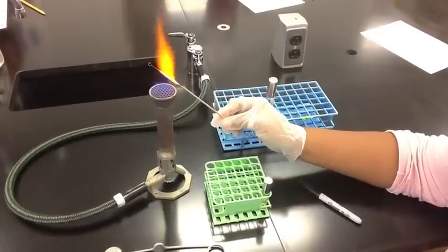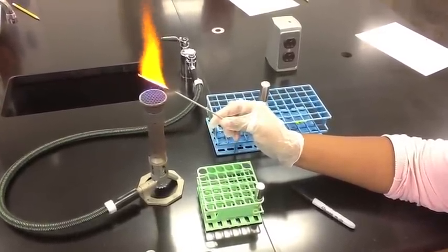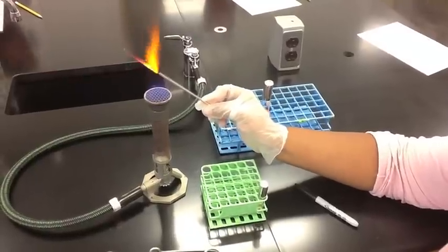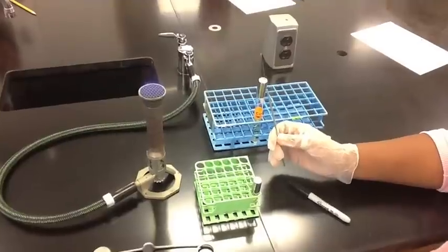The inoculating loop must turn red hot to ensure that it is sterile. Before you can proceed, you must allow the inoculating loop to cool off.